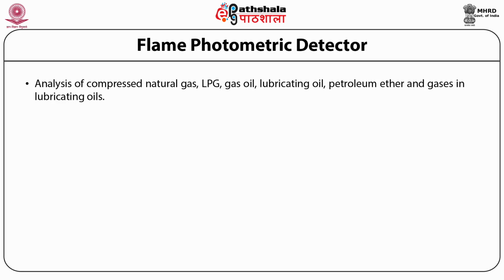Gas chromatography offers a very powerful compound-specific alternative to the infrared methods for hydrocarbon analysis.